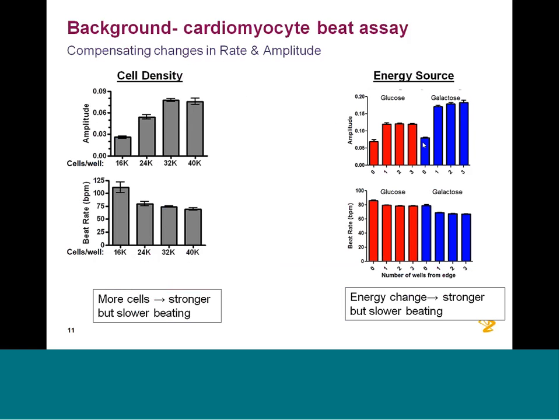Just to be over the top in terms of our data quality, we haven't been using the edge rows for anything other than the repeated control that we include in each experiment. So that's a good way, that we find that to be a good way to use that.